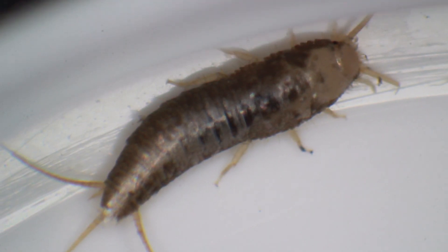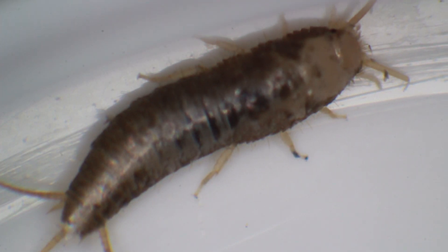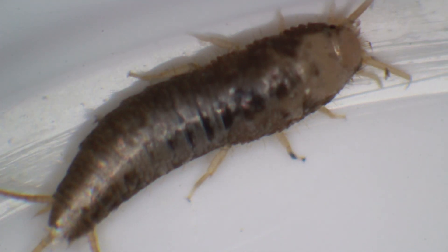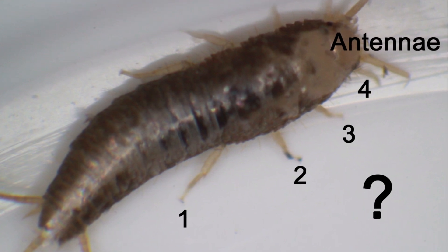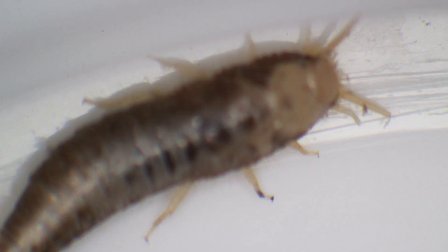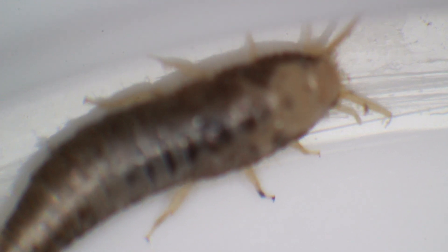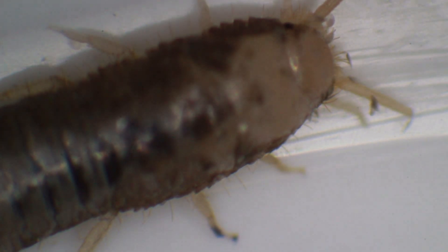Look carefully - how many legs does it have? Can you count the legs here? There is of course a pair of antennae, but then I see one, two, three - there are four pairs of legs! Spiders are supposed to have four pairs of legs. These are insects - they should only have three pairs, six legs. This really confused me.